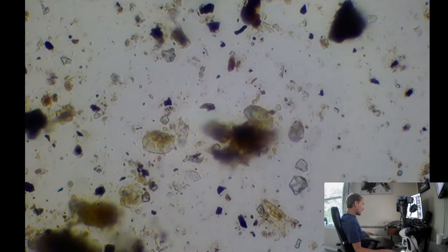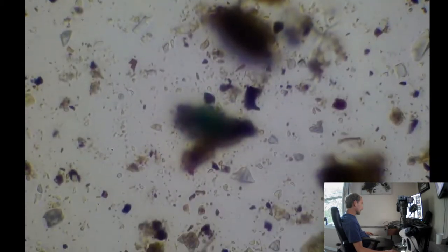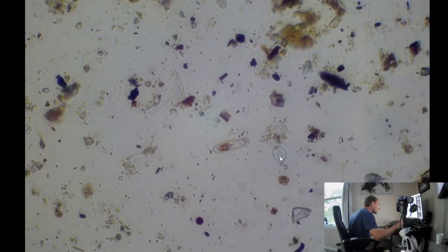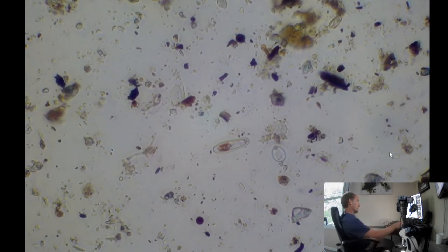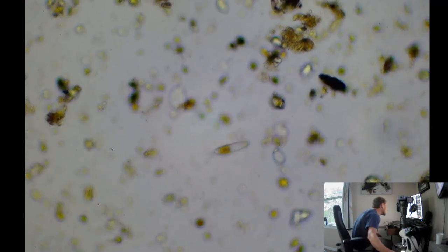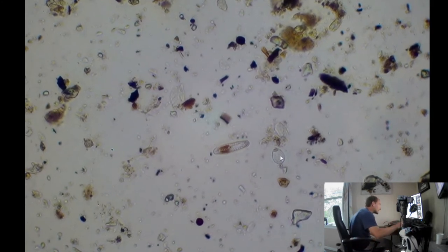Where'd you go? Uh-oh. Where was he? Thought I had him pretty centered. Where'd he go? What are those? Oh, that looks like a little... it's an amoeba. That's an interesting looking... gotta be some sort of amoeba. Or a cyst, a creature living inside. Let's see what we can see there. Could be a fragile cyst. But yeah, that's definitely amoeba. That's what you want to see.